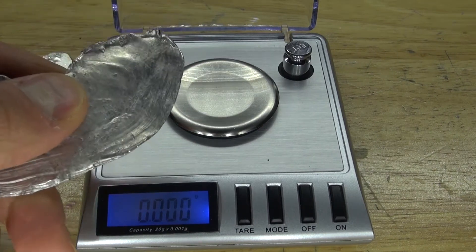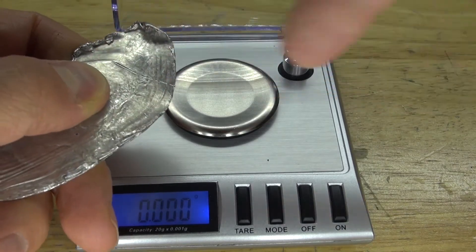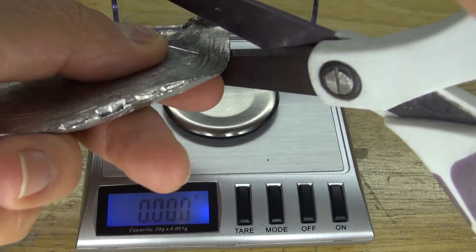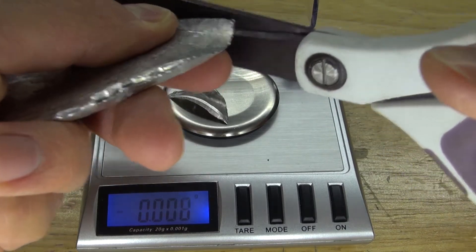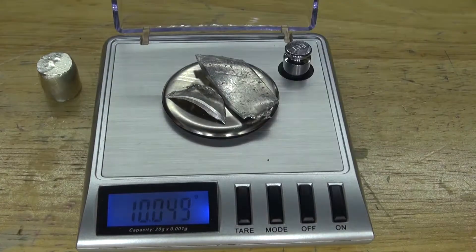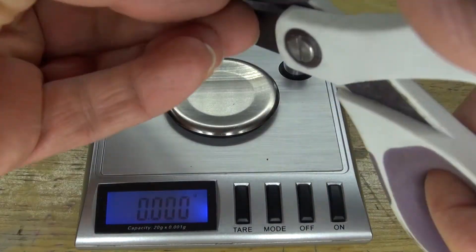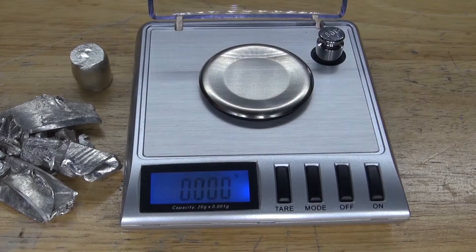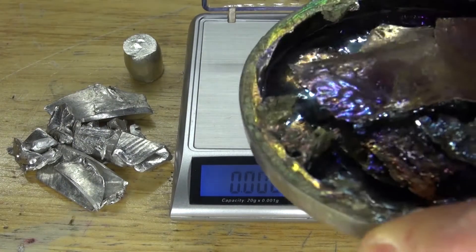Next, weigh out the indium metal. Since indium is such a soft metal, I can easily scratch it off my nail, which means I can easily use scissors to cut this metal. Cut each piece, figuring out what the weight is going to be. There — 51% indium, or 51 grams of indium. Next, I need to weigh out the bismuth.